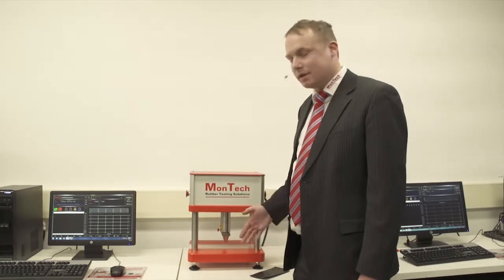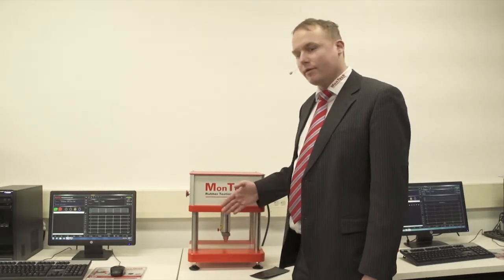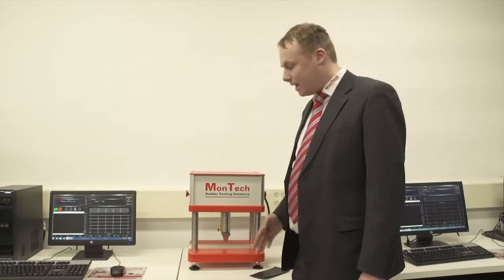Montec offers a variety of sample cutters for cured rubber specimens: the P-VS3000 with a single knife, with rotation option to fit multiple knives, with multi-knife options to do several cuts at the same time, as well as sliding table options for efficient preparation of multiple samples one after the other.